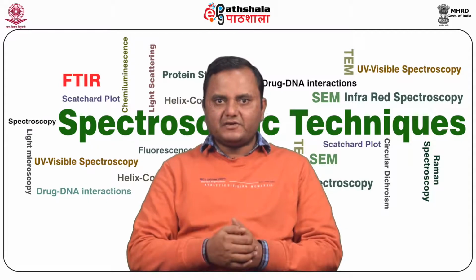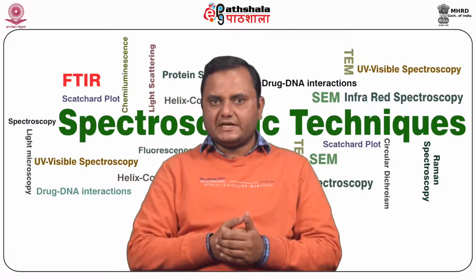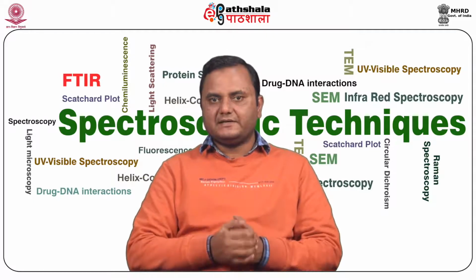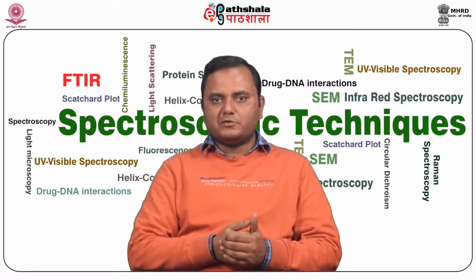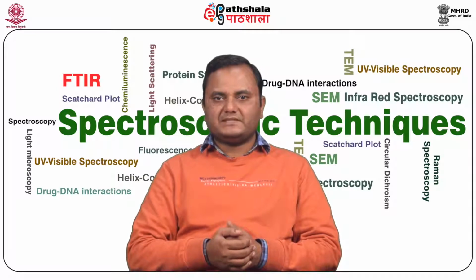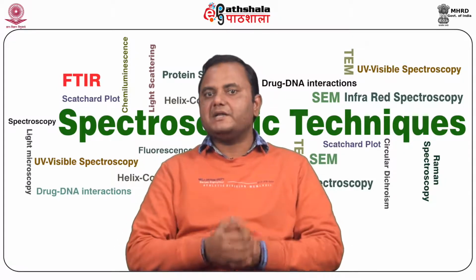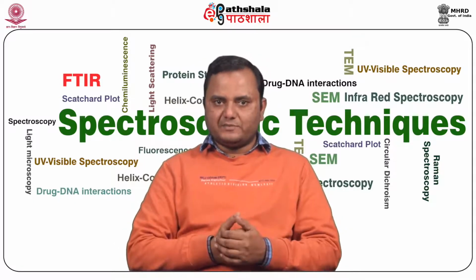So phenylalanine, for example, shows maximum ellipticity at 250 per mole per centimeter, tyrosine has 1000 per mole per centimeter, and tryptophan has 5000 per mole per centimeter, and this property is used for the estimation of the tertiary structure of a protein.